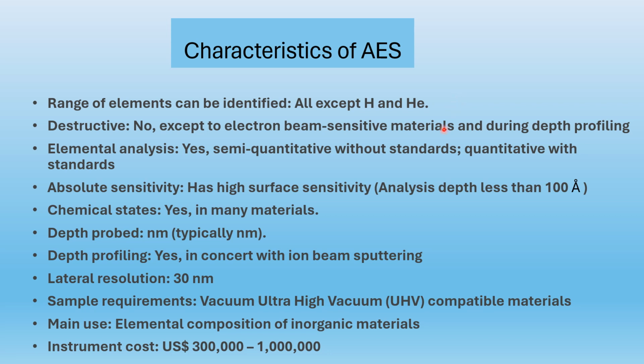Also, the technique is non-destructive in nature, and the elemental analysis can be done very easily by using the eye on the graph. Also, we have a high surface sensitivity, and analysis depth can be taken up to almost 100 angstrom. Chemical states in the materials can also be known.